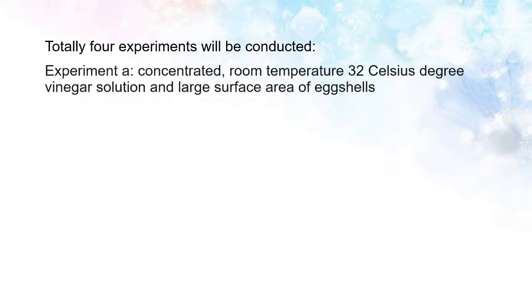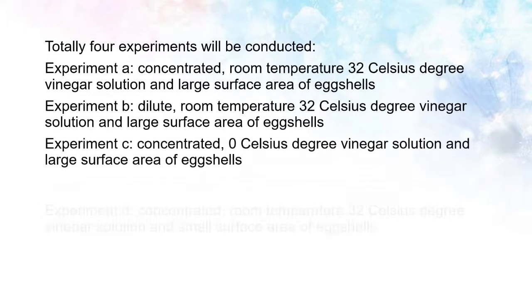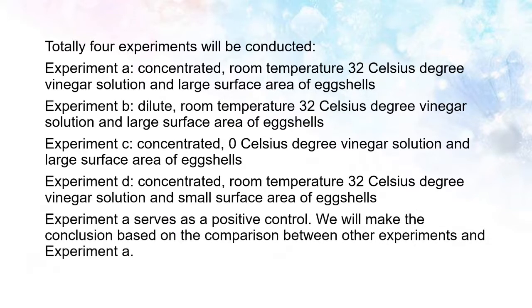This experiment that will be conducted is the control experiment. The purpose of this control experiment is to ensure that the changes in the rate of corrosion during each experiment is only affected by the variable that the particular experiment is trying to investigate.